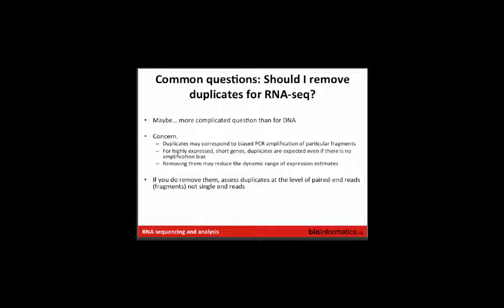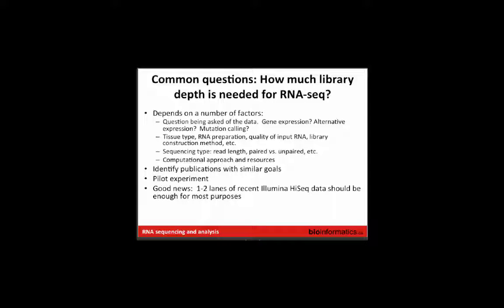Yeah, I think it might be possible. Yeah, I don't know. There's not a good answer because you wouldn't want to start removing duplicates for some libraries and not for other libraries. So, yeah, I think it's just something to be aware of that you may have issues in your libraries and that there's not really a good way to remove them. So you kind of have to live with it to some degree.